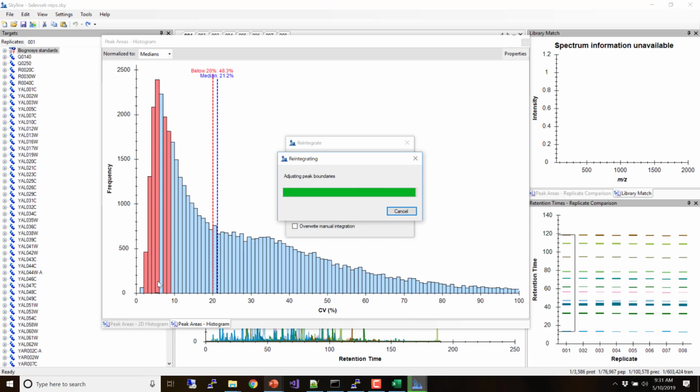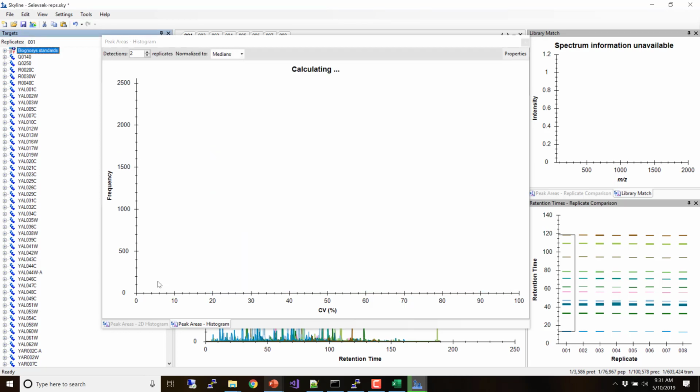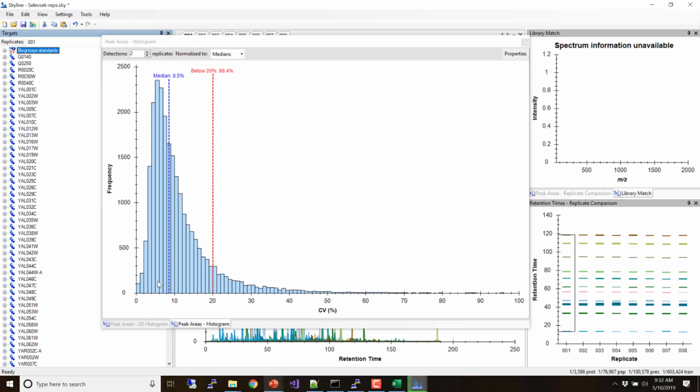You're not going to look at all those. But Skyline allows you to spot check anything you want. And it might be informational to just go through like 5 proteins and look at all the parts. All of a sudden, I don't know that everybody had this. I maybe was playing with it. Does everybody's graph change to look like mine or not?